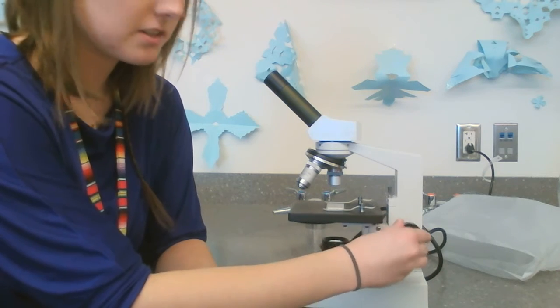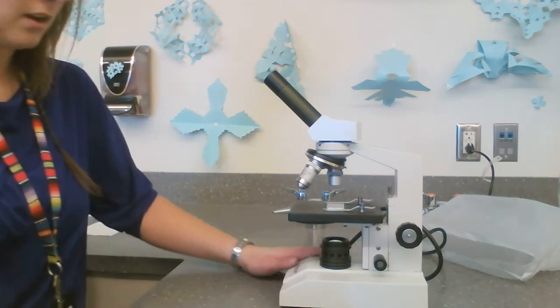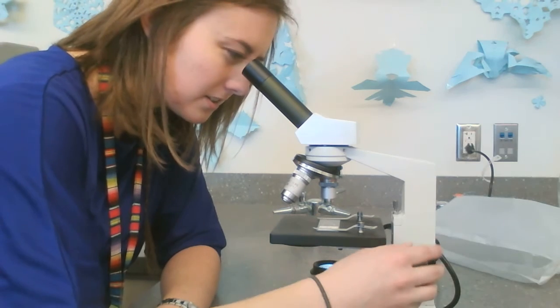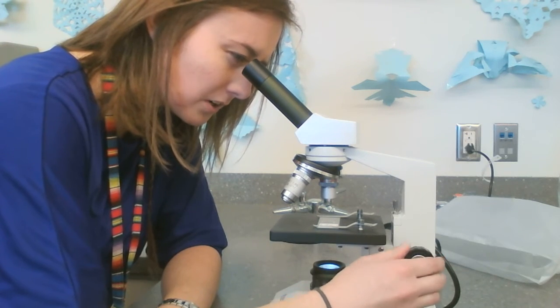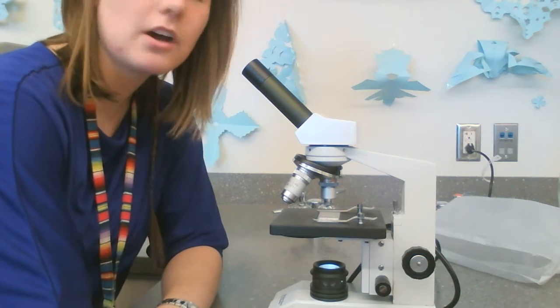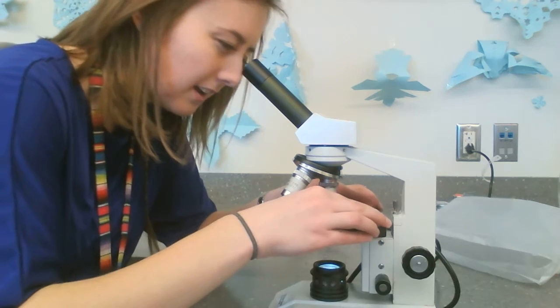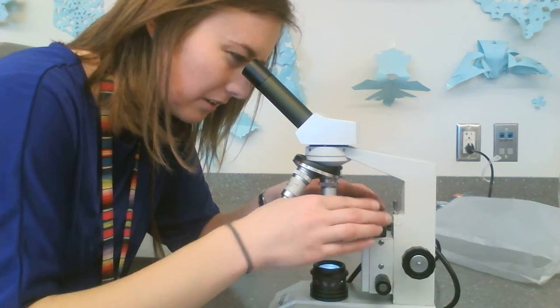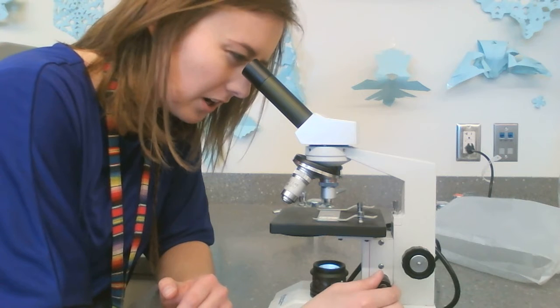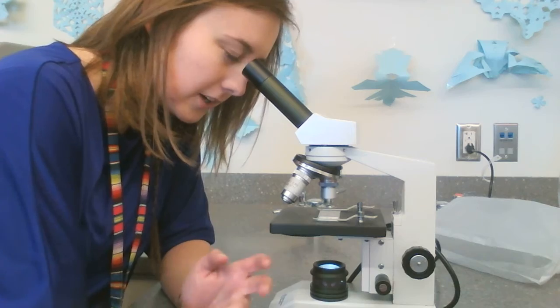We also start with the stage all the way down to the bottom and use the coarse adjustment knob for that, okay? Then you need to turn on the light source. You look through the eyepiece, and then you use the coarse adjustment knob to get it into focus. Now, the coarse adjustment knob moves the stage really fast. So once it's mostly in focus, you can switch to the fine adjustment knob and fine tune the focus, make sure it's really clear. So now I can see my hemp really clearly.